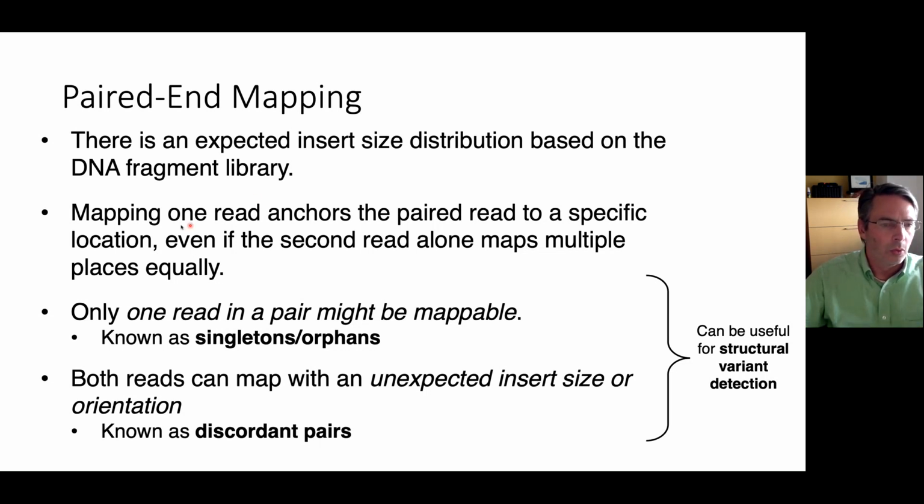And so mapping will use the reads as anchors to a specific location, and then see if the internal spacer is the right distance.